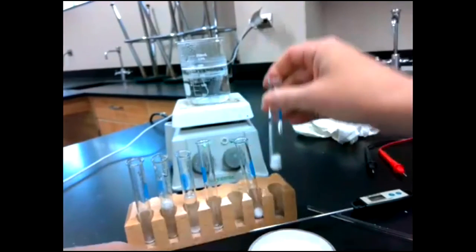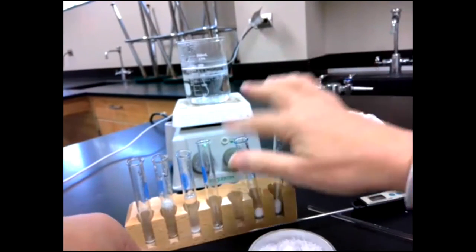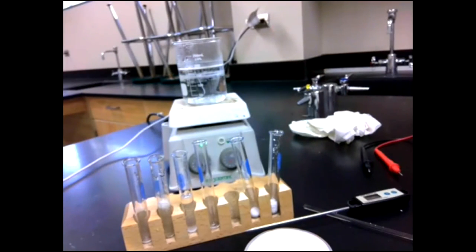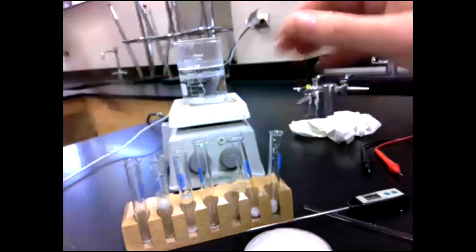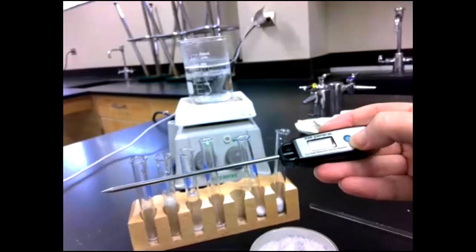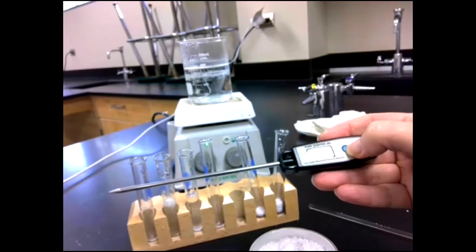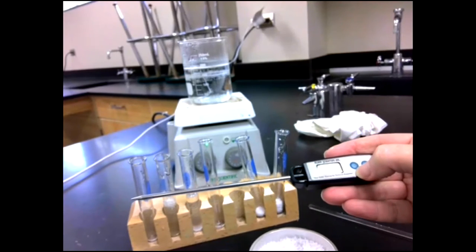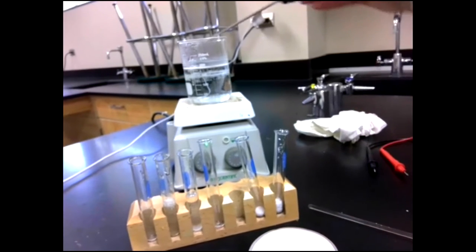So that's B. And again, I'm gonna do A first and then B second. So where's my, shoot, I keep losing stuff. First thing I'm gonna do is measure the temperature. This has made me realize that I think our thermometers are all not calibrated very well. So it should be 100.